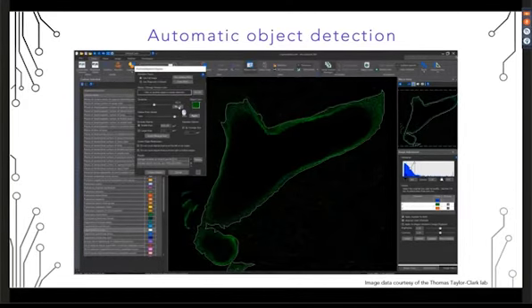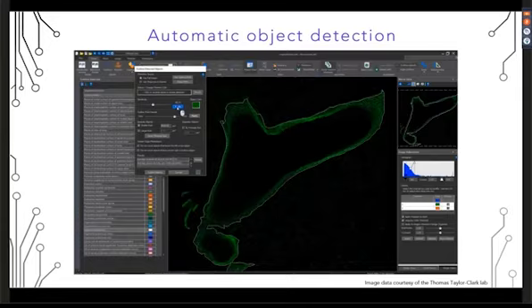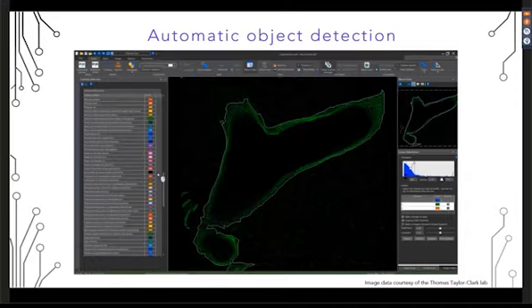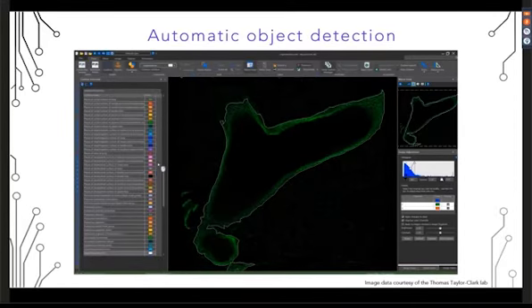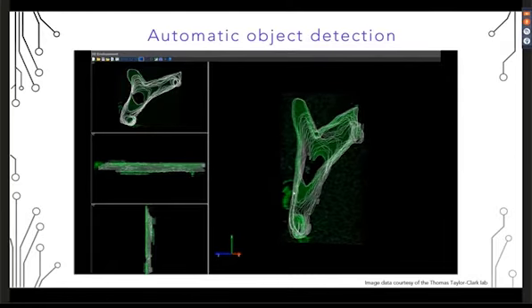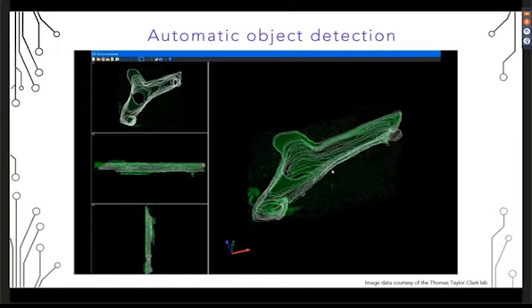Use the Outline Objects modal window to filter detected objects by increasing or decreasing the sensitivity slider or excluding objects by size. When you are happy with the results, outline the object and repeat on different colored objects in your images. Repeat this process on more planes at an interval until you have fully represented the relevant structures throughout the image stack. The unique ID for each contour will be stored within the data file.